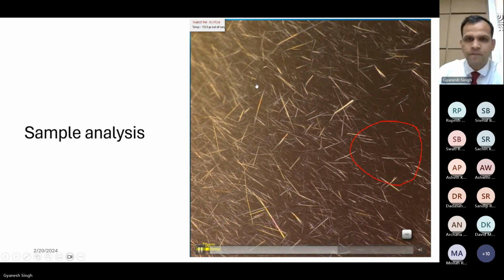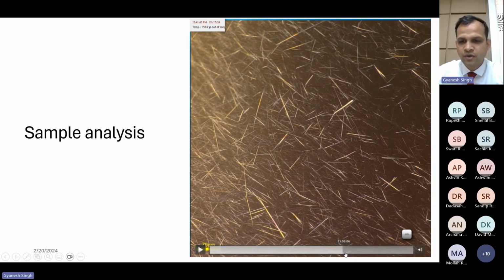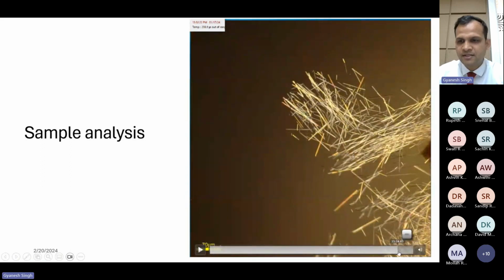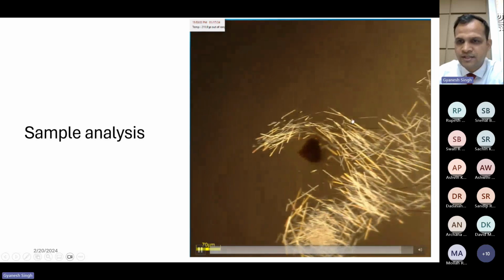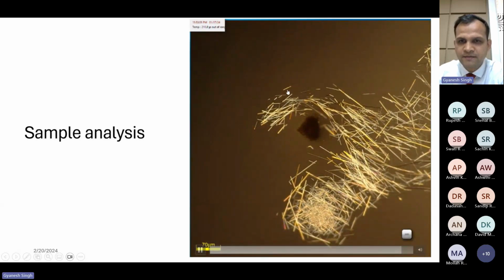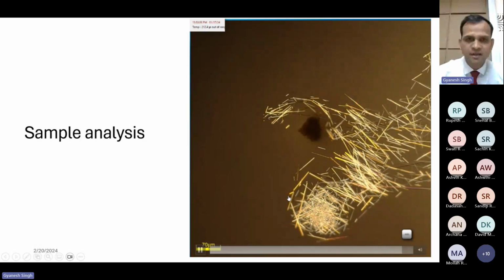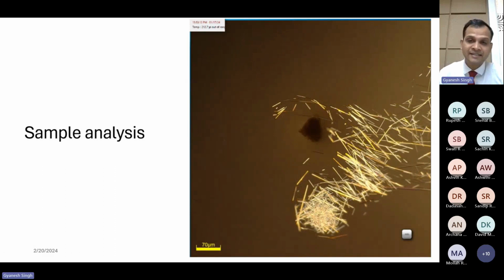Second melting. And see the top temperature is 153.6. And now I'll be showing you these rod shapes have their own melting, something like this. So you can see them, individuals are melting. So this change is seen easily, but a lot of changes are not seen that easily.